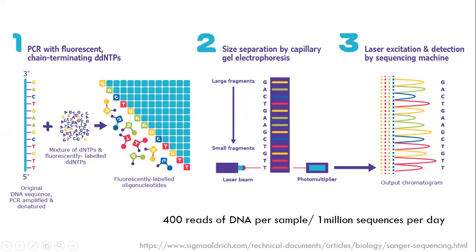At the same time, you are bombarding the in vitro reaction with a lot of excess dNTPs. By allowing that, they may get multiple varied lengths of the same template, a combination of 4, 6, 8, 10, but the longest you can get is up to that 13 nucleotide length, based on the length of the template or whatever hybridization can happen, right? It cannot exceed that because the template doesn't have more nucleotides here. You get a varied combination of extensions of different nucleotide lengths coming through this hybridization reaction.